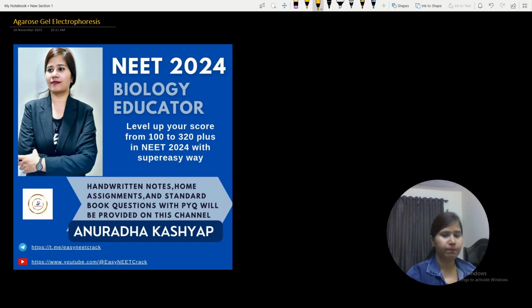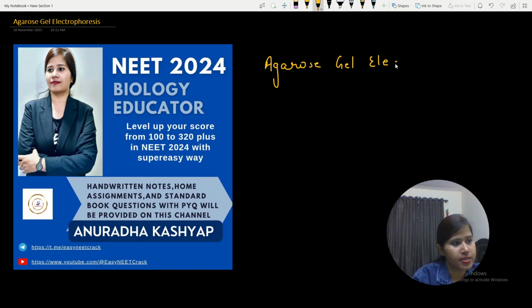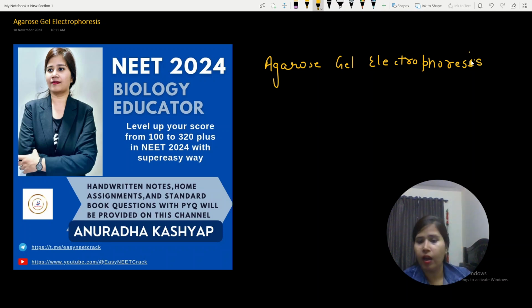Students, first of all, we are going to define the term agarose gel electrophoresis. I am going to tell you all these things in a very simple way. This is our concept, electrophoresis. This is the name of the technique: agarose gel electrophoresis.